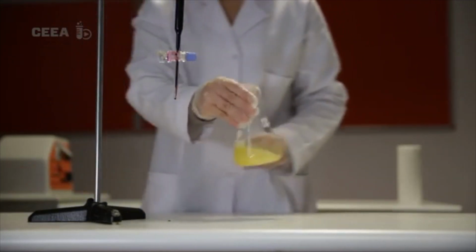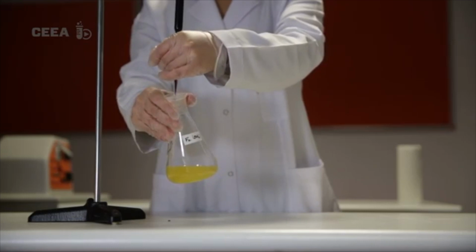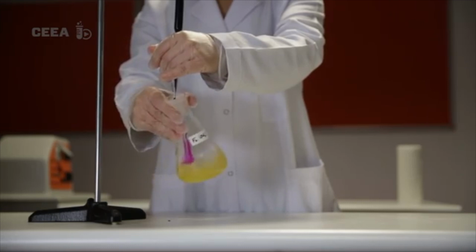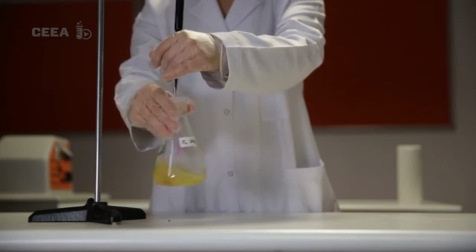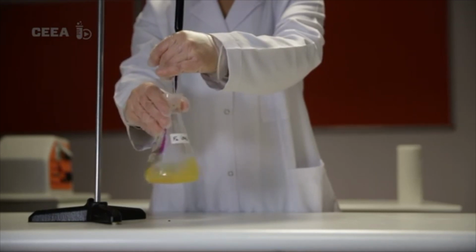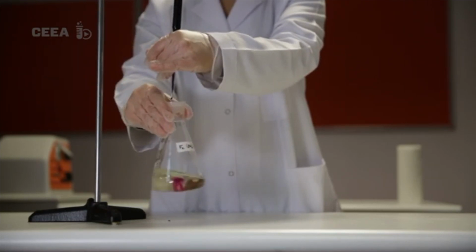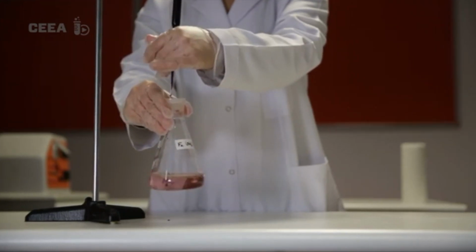And when we add the potassium permanganate from the burette, you can see as soon as the potassium permanganate touches the Fe2+ solution, it turns colourless. This is because the Fe2+ ions are converting it to Mn2+. Now at the end point, we have no Fe2+ ions present, and we see a permanent pale pink colour.